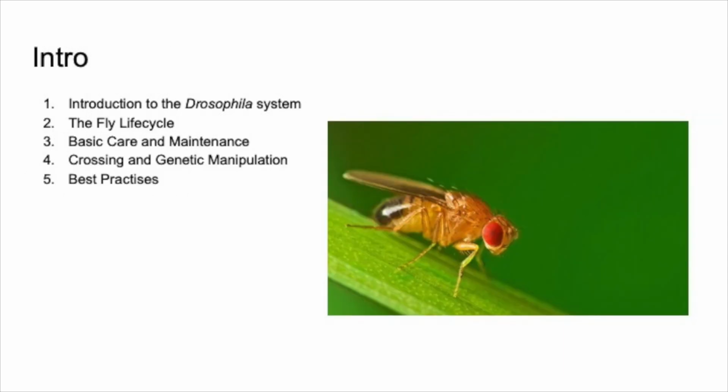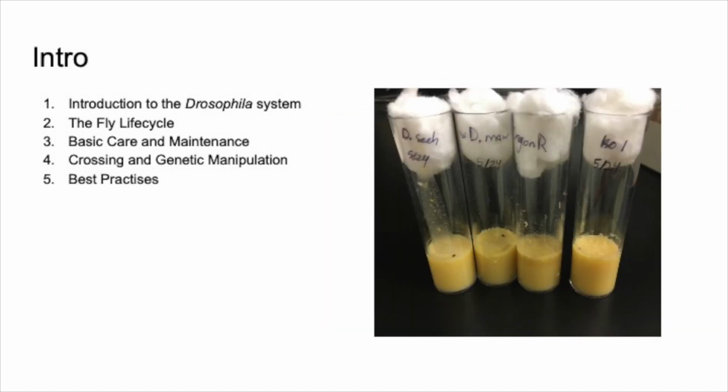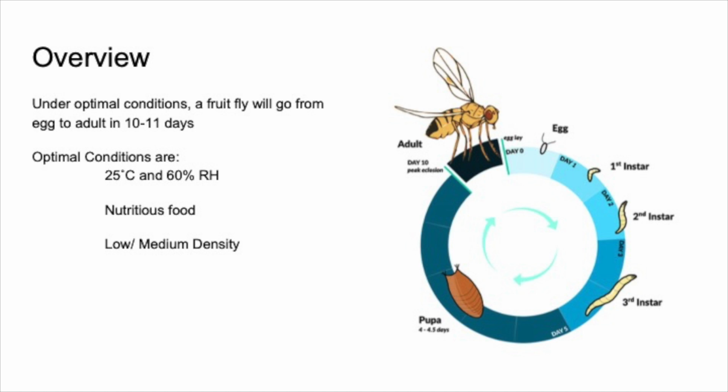In this video, I'm going to give a brief introduction to the Drosophila system, covering a number of important components, such as their life cycle, basic care and maintenance, crossing and genetic manipulation, and best practices for raising and keeping fruit flies. Okay, let's dive into it.